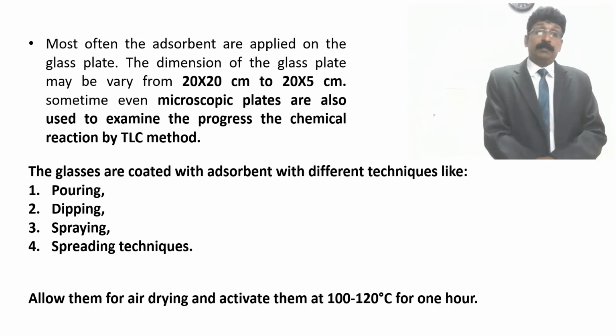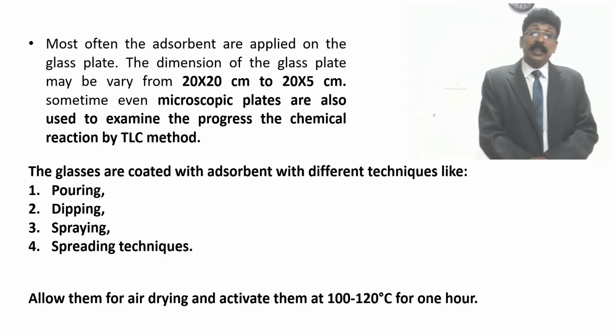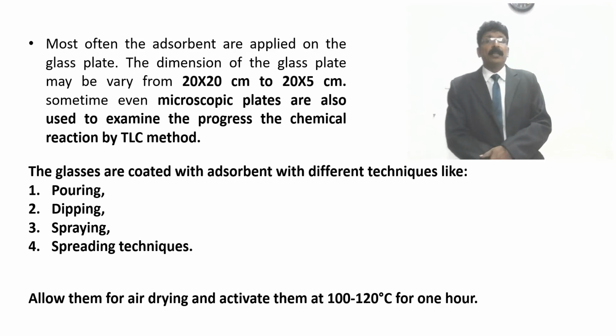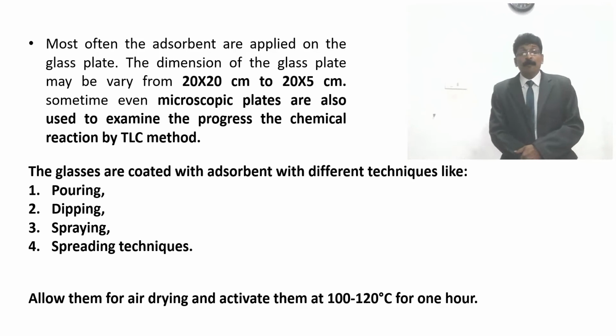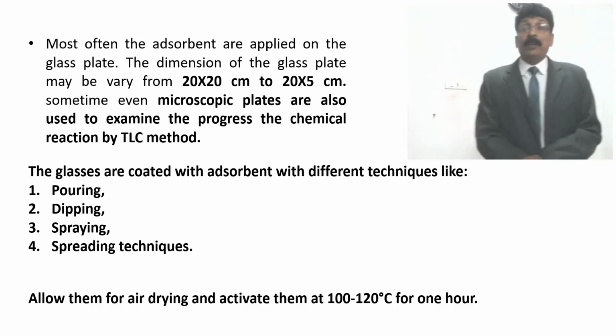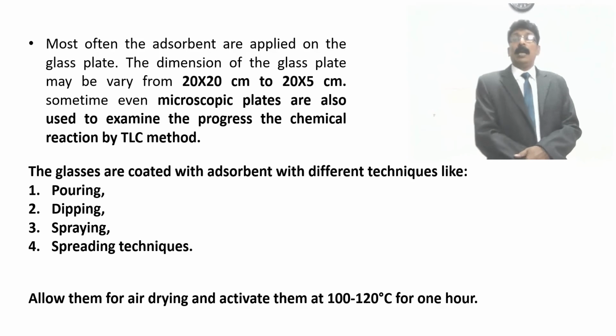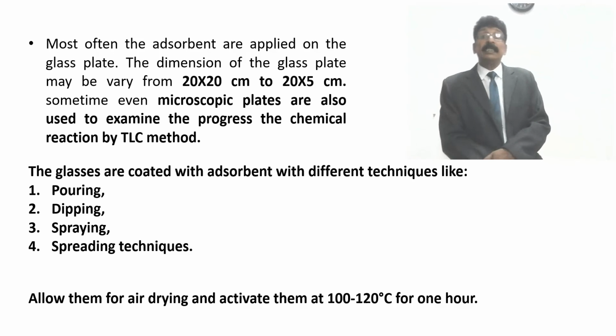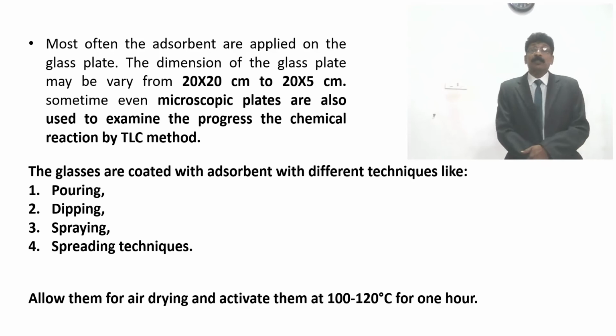Allow them to dry. Students should read and understand the methods of preparing, how they do pouring, how they do dipping for a thin layer on glass plate, thin layer on aluminium, thin layer of silica. This method of preparation of thin layer chromatography is also needed for students to know.